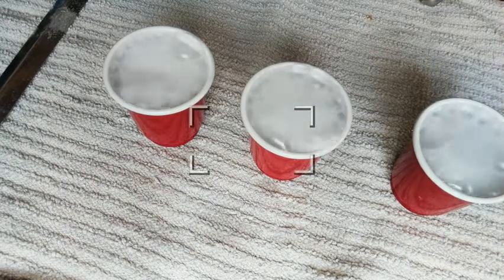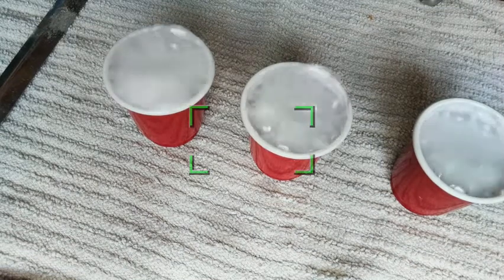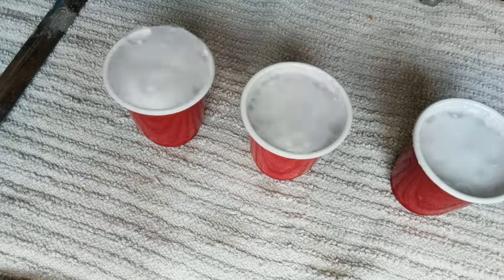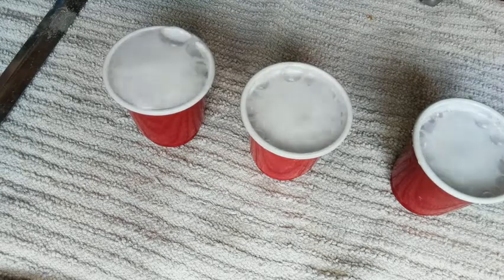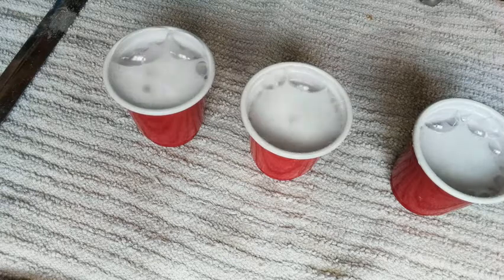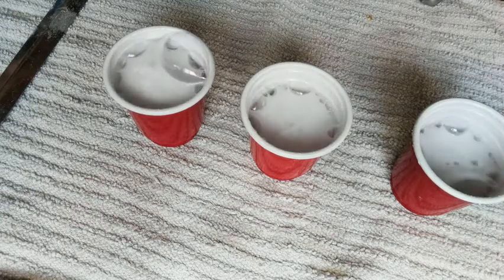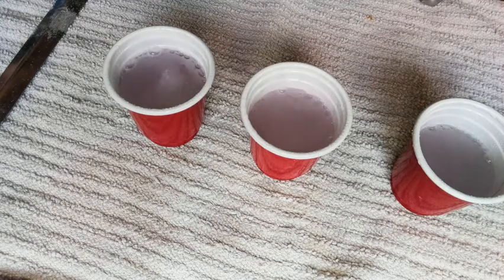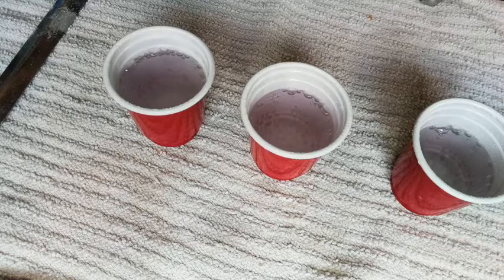Ooh, much more vigorous reaction. Note those things, by the way, everybody. Note how vigorous the reaction is, and how intense it is, because those are things you're going to want to note.